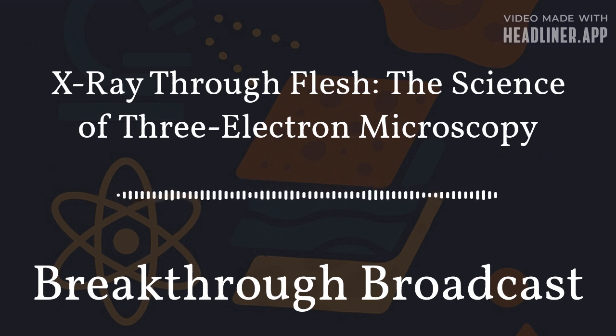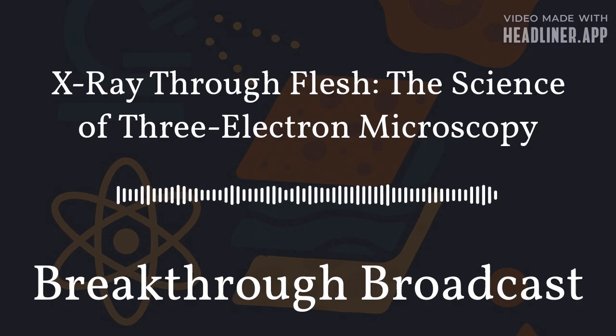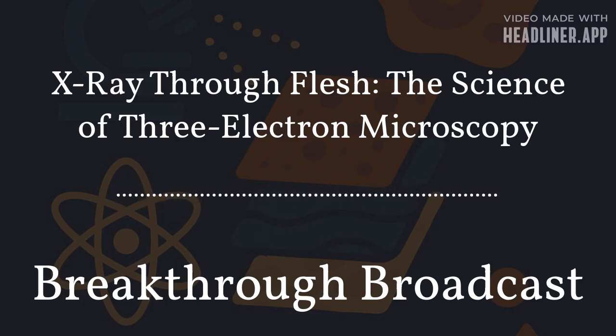Material science and bioengineering also gain new advantages. Synthetic biomaterials, engineered tissues, and medical implants often have complex interfaces where biology and non-biological materials meet. Traditional imaging can show either the surface of the material or its inner layers, but not both at once. With three-electron microscopy, researchers can study how cells adhere to scaffolds, how structures behave under stress, and how engineered tissues integrate with host environments.